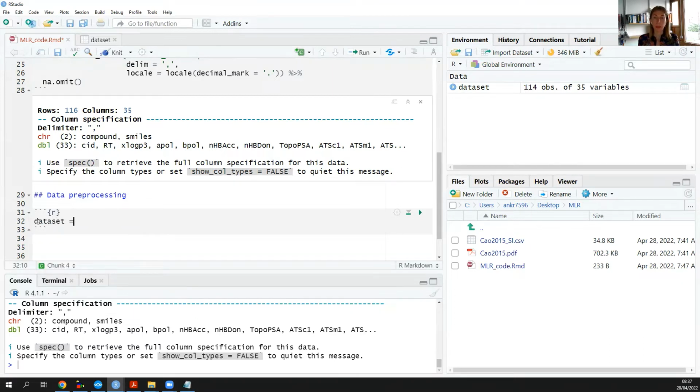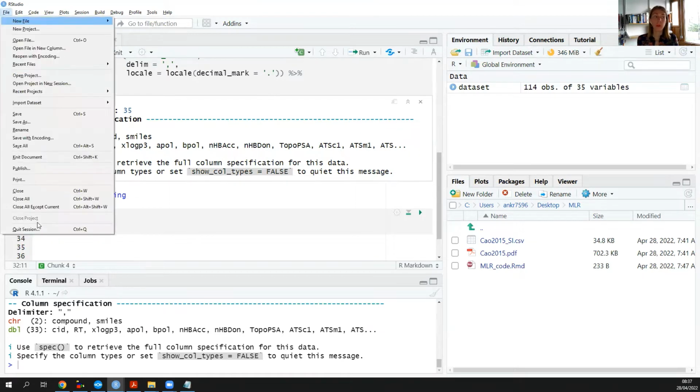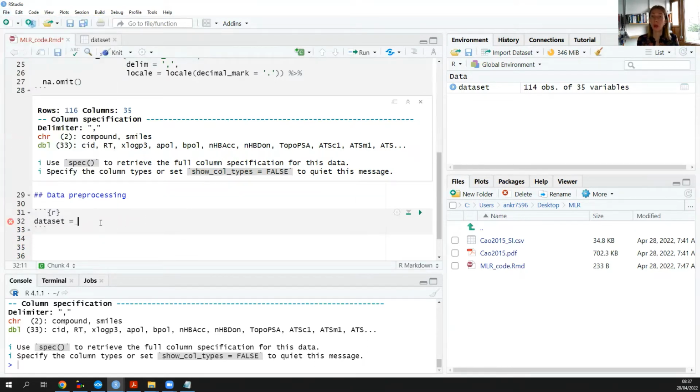The thing is that we want to do this correlation investigation only for the columns which are our descriptors, so the ones which we'll be using to predict the retention time. And for practical reasons, we want to move the other columns, which are additional information, to the end of the data frame. This is just for practicality so that we can remove the highly correlated descriptors most easily.